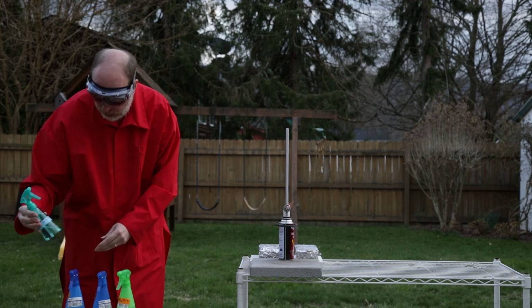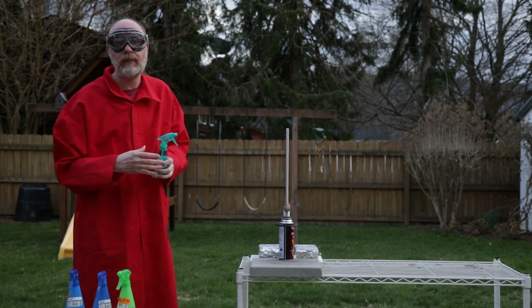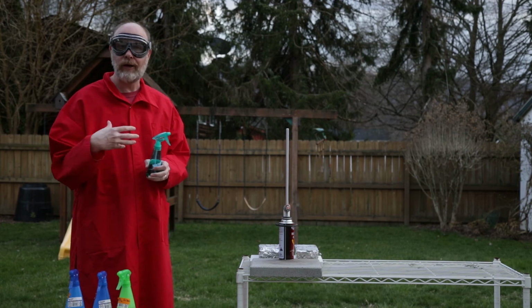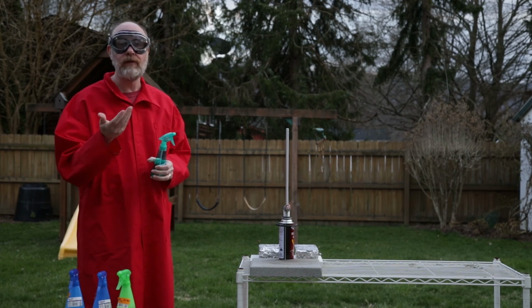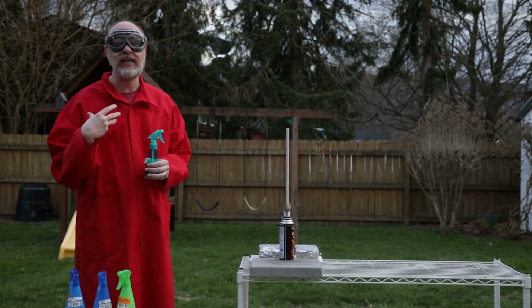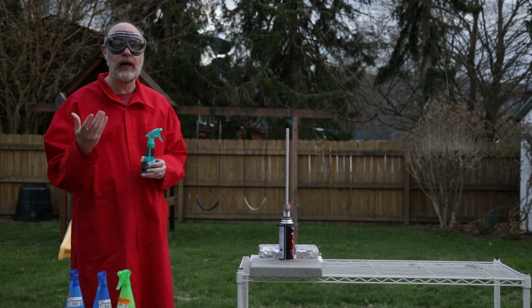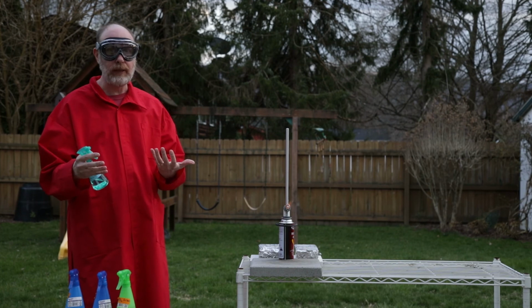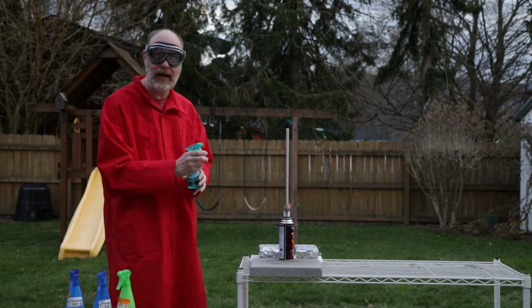We're going to then move on to the red. We've got two different pigments that are used in red. And you know, before we go any further, you might think about, okay, how would this ever be used? But if you've ever seen fireworks, this is exactly the same type of chemistry that would color a firework. And so lithium and strontium was what would be used as red. So we're going to see lithium next.